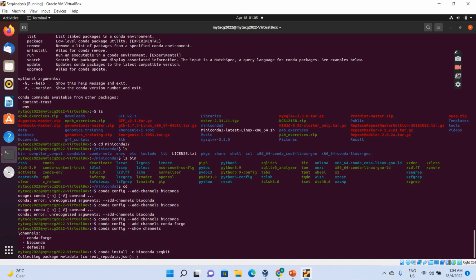The installation should be very fast. From my experience, this SeqKit needs no more than 1 minute to download and install by Conda. But of course, this also depends on the internet speed that you have in your place.